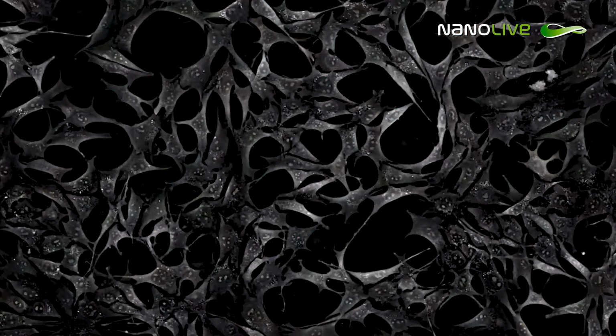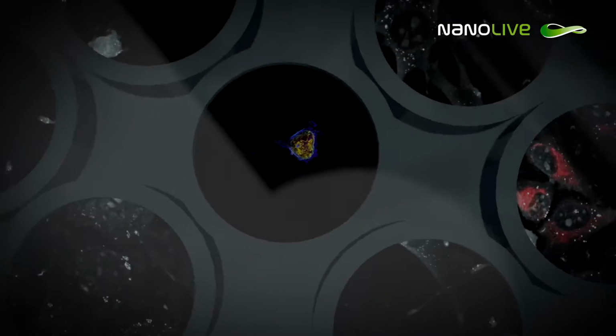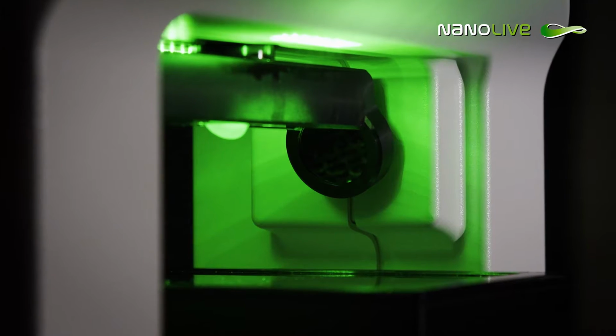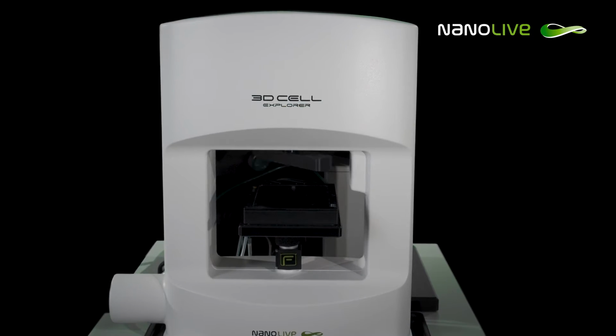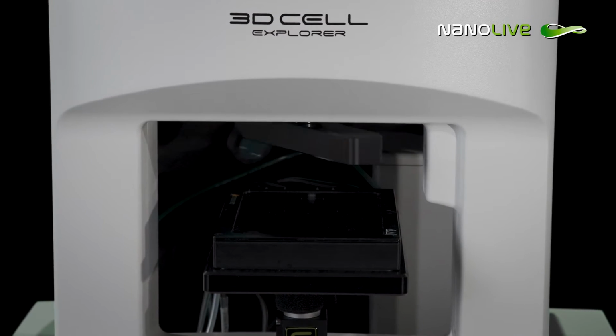The cell is the basis of all life on Earth. The capacity to interact with living cells holds the key to making great discoveries. Nanolive's CXA, together with its quantification software, Eve Analytics, represents a significant breakthrough in the field of quantitative live cell imaging and analysis. It's extremely easy to get highly relevant, content-rich data with Nanolive's CXA platform.